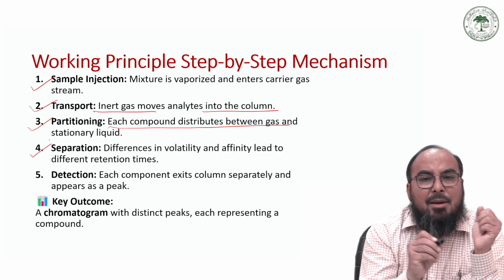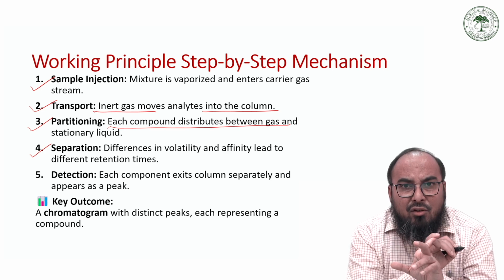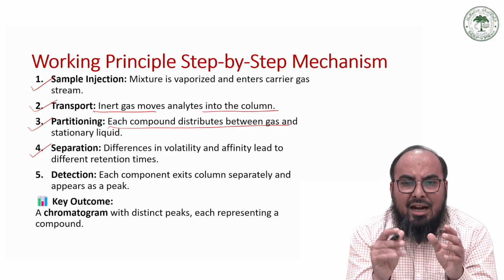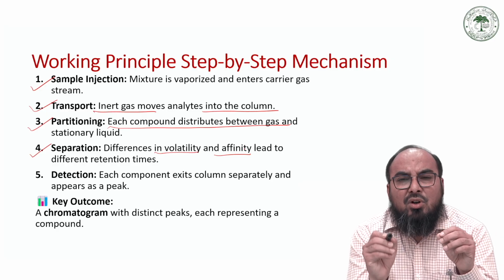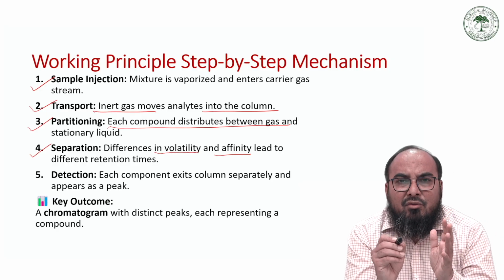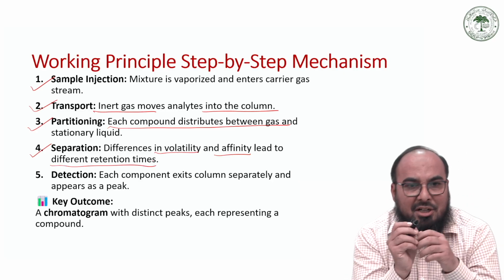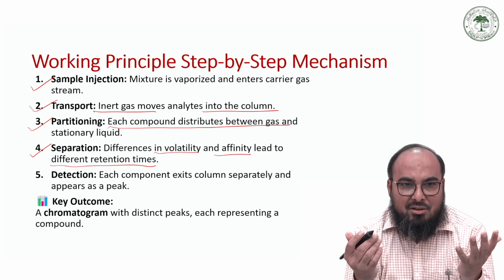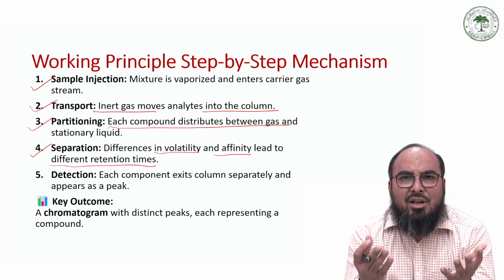Then of course separation takes place, and this separation occurs on the basis of the difference in volatility or affinity with the stationary phase. This difference gives rise to a difference in their interaction with the stationary phase, and this leads to a difference in retention times, which gives you a good separation. Greater the difference, greater will be the separation, better will be the efficiency of your column, or you can say better will be your GC technique.